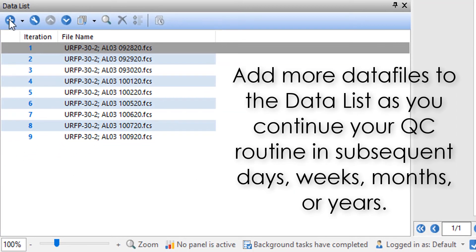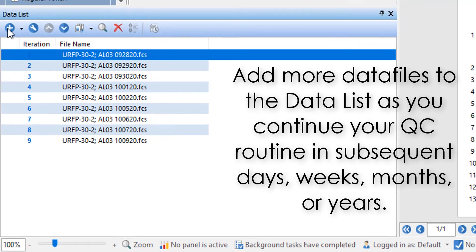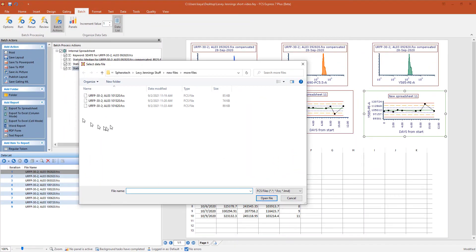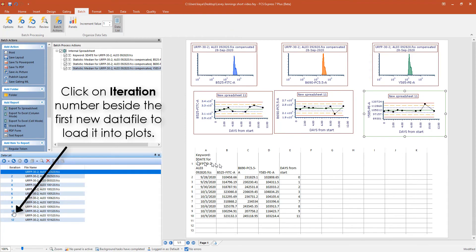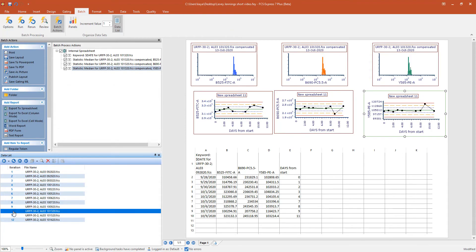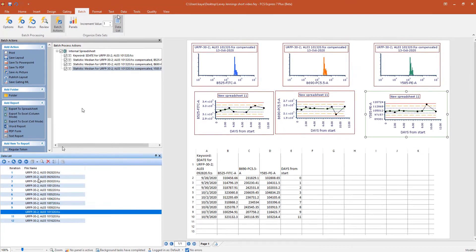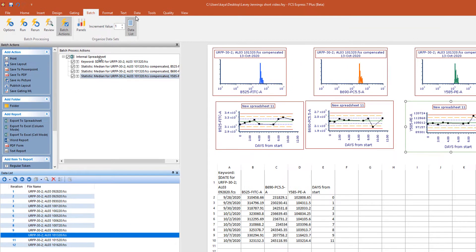You can add more data files to the layout as needed as you continue your longitudinal quality control. Click once on the blue iteration number beside the new data file to show it as the active file within plots.